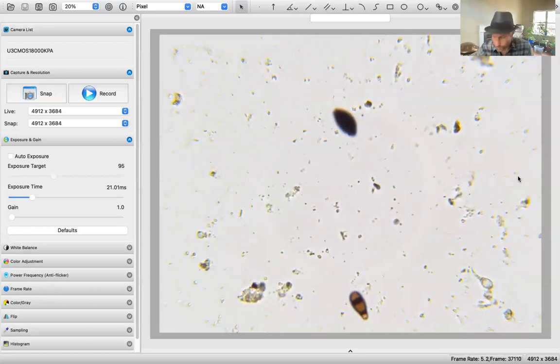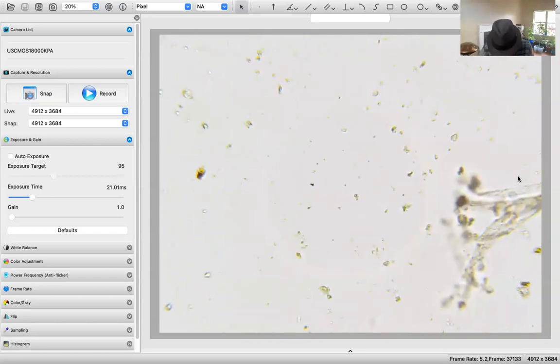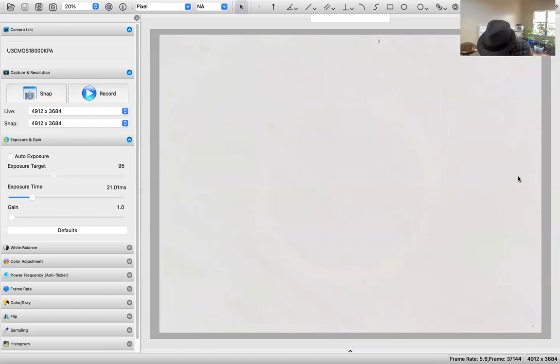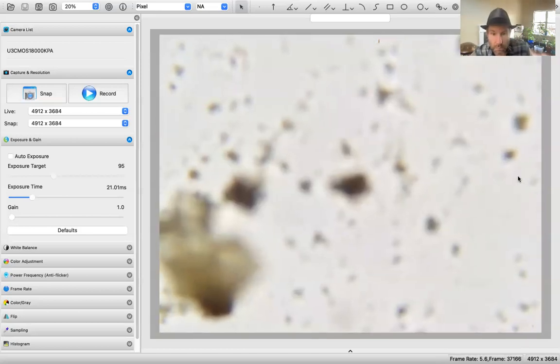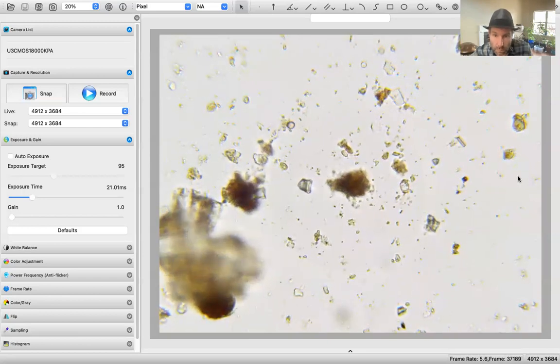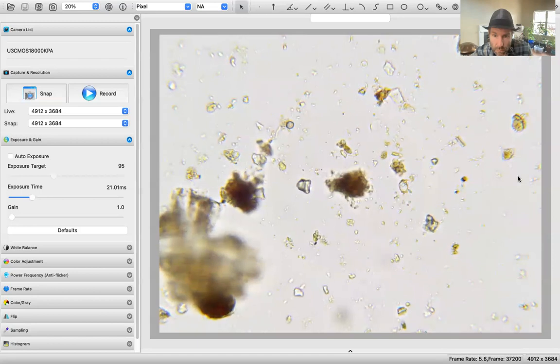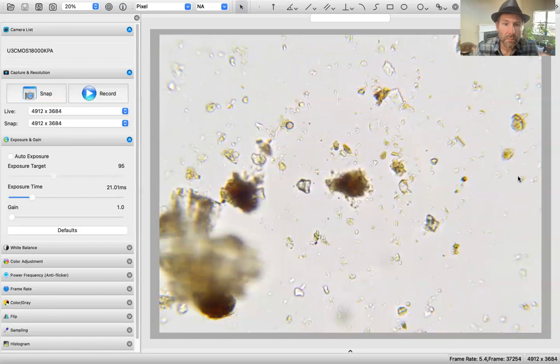Yeah, okay. Not one flagellate. Crazy, not one flagellate.